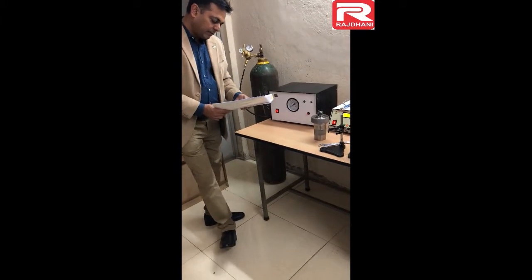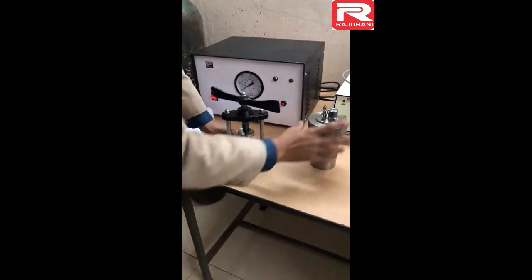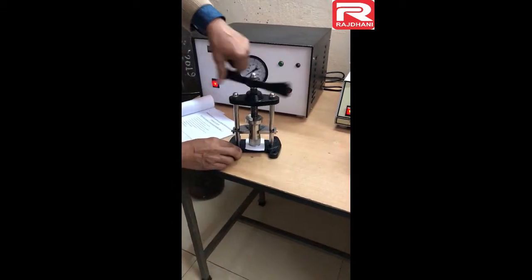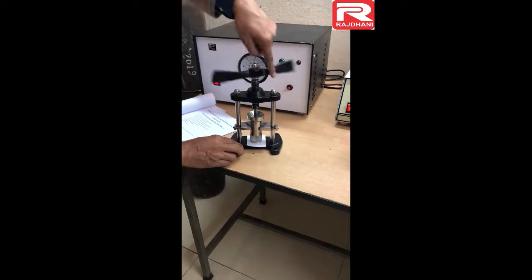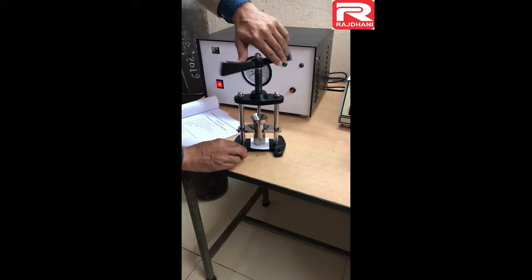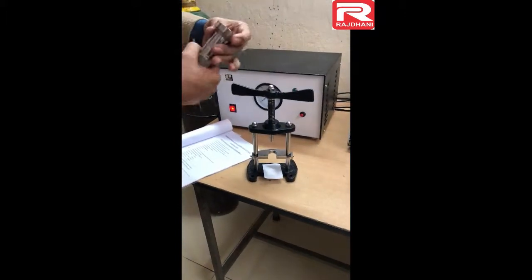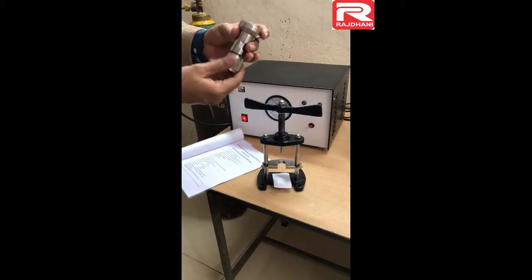Item number 10 is the pallet press. This is a screw-type pallet press. This is the pallet press cup which opens from the bottom.